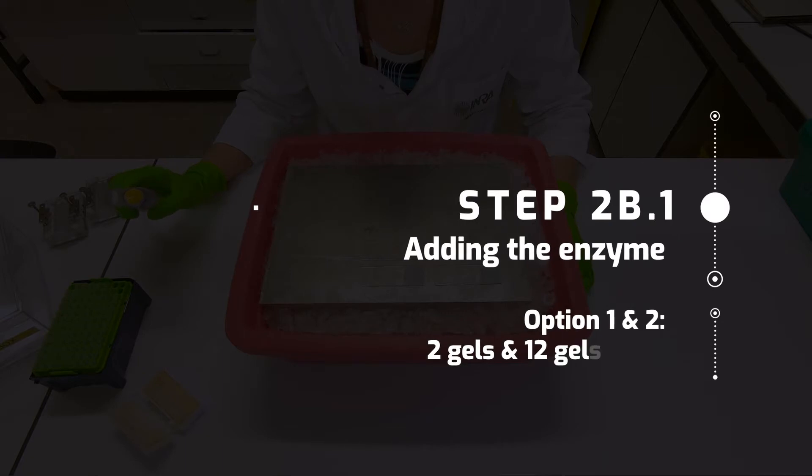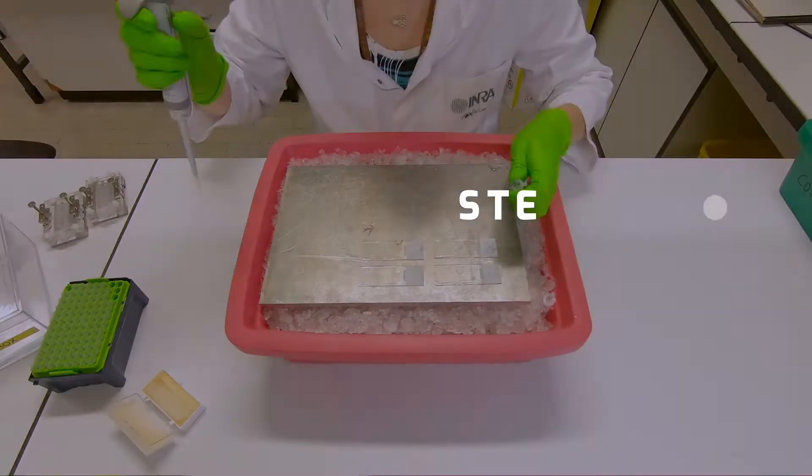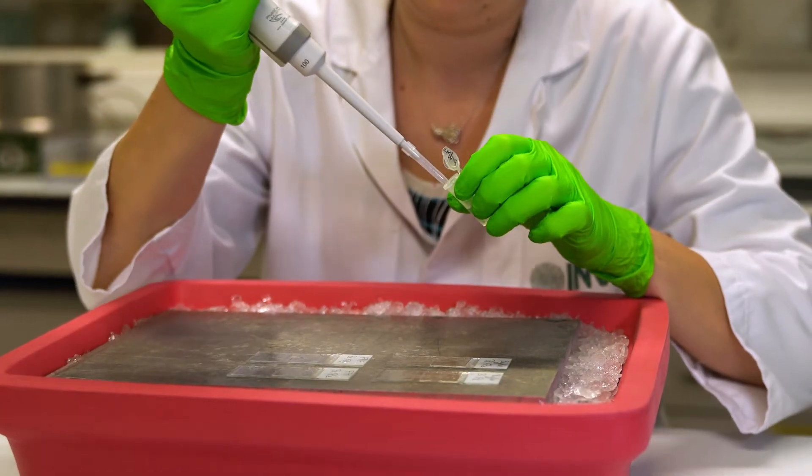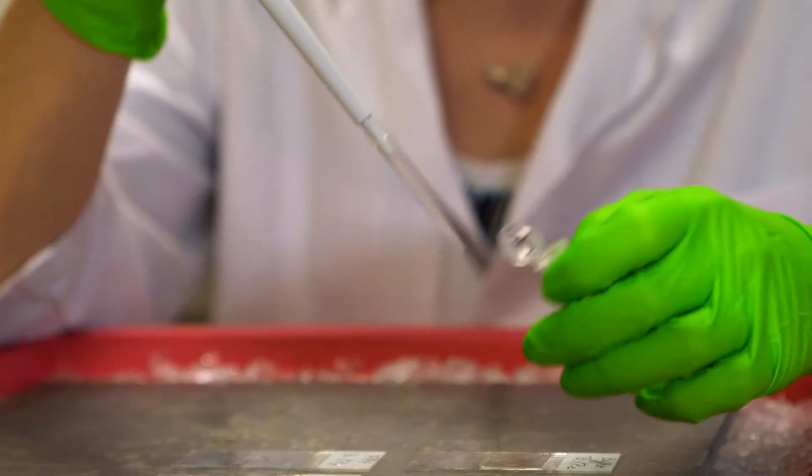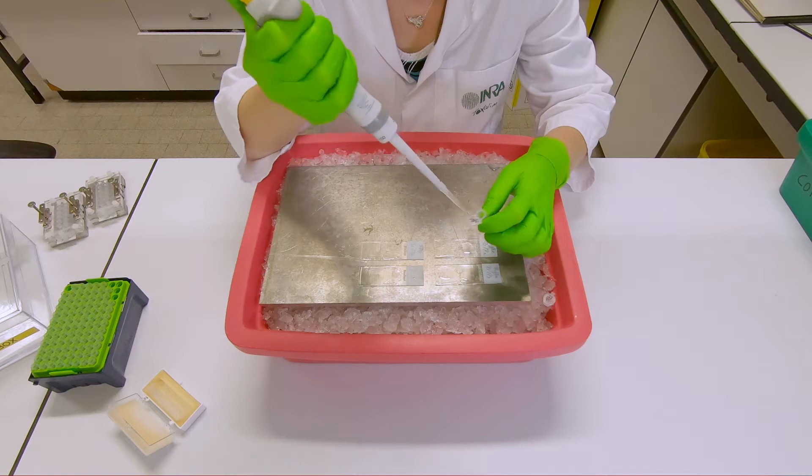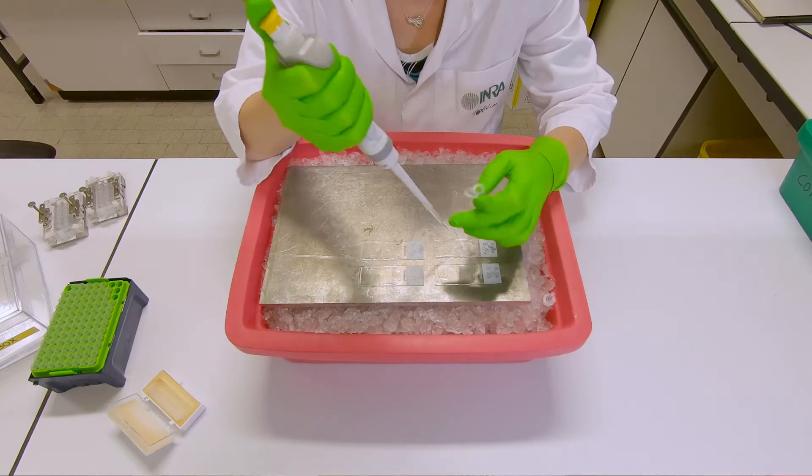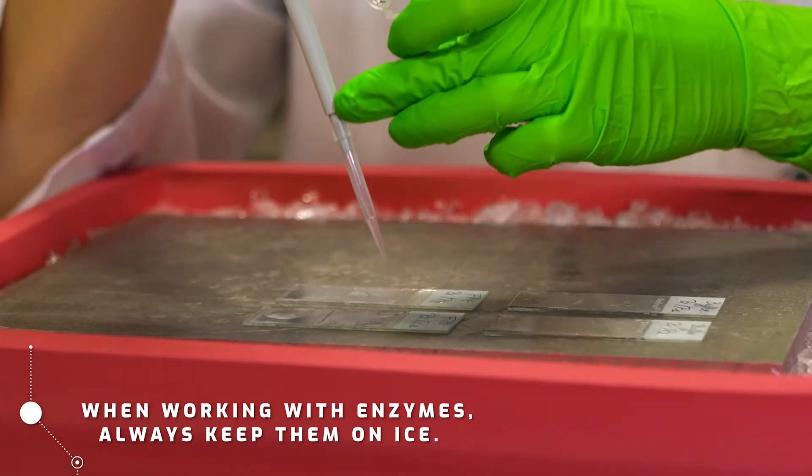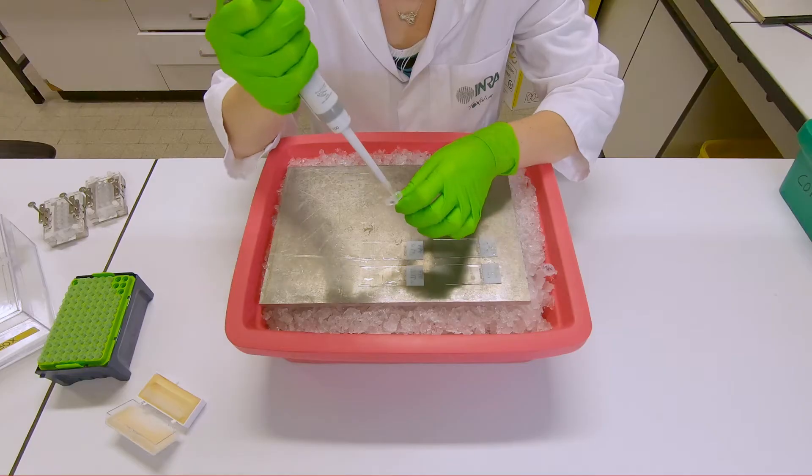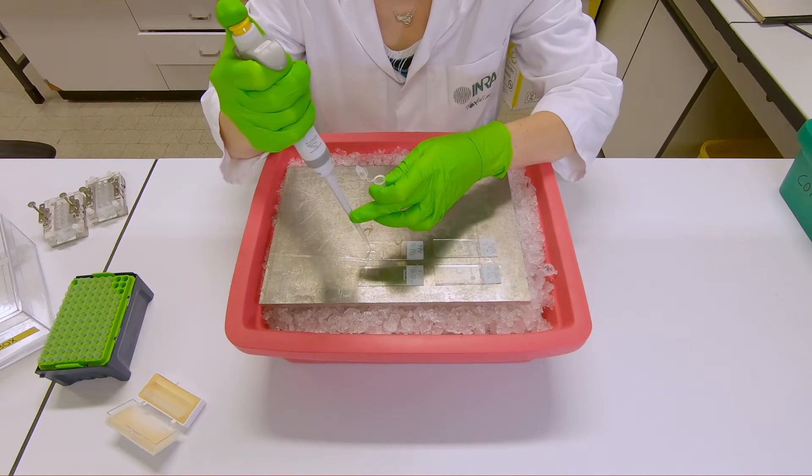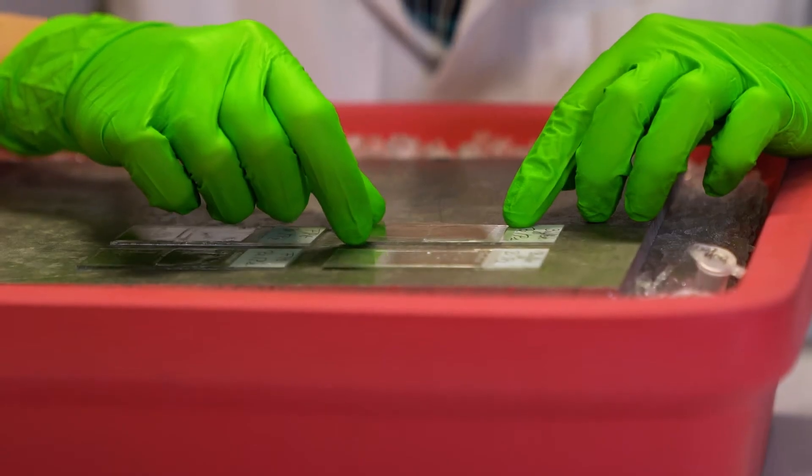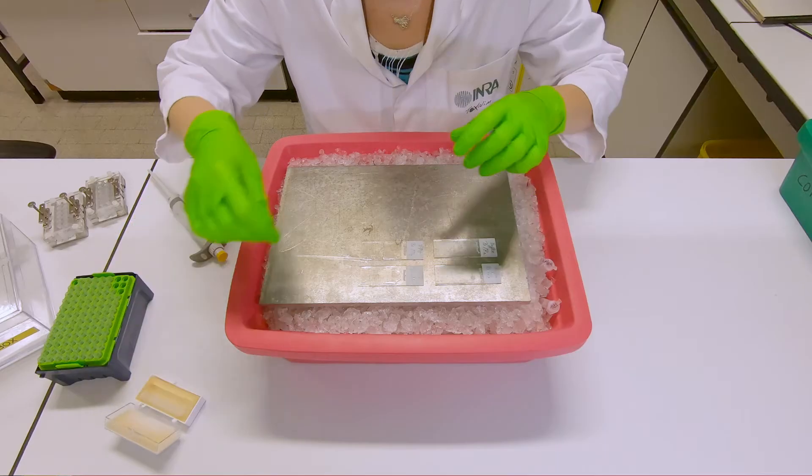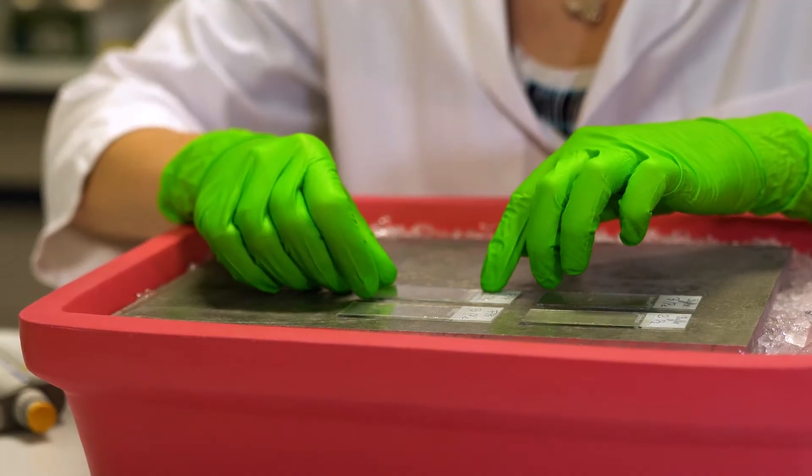After washing the gels with cold enzyme reaction buffer, transfer them to a cold metal plate and add 50 microliters of either the buffer or the enzyme to the corresponding gels. Then place a coverslip on top of the drops.